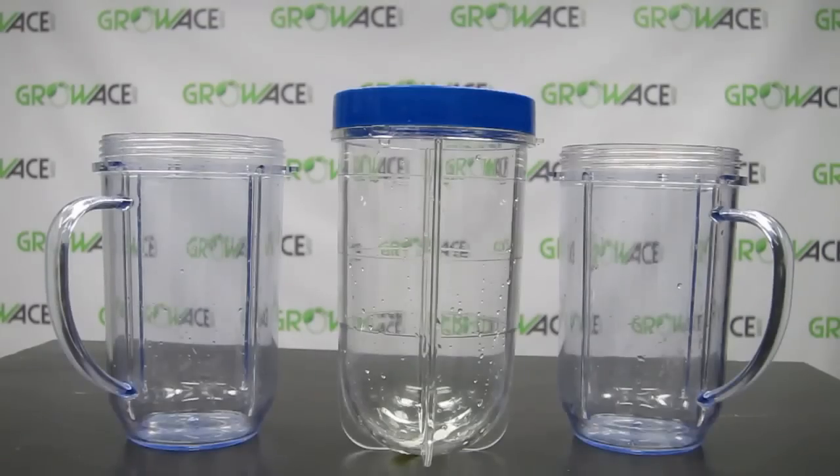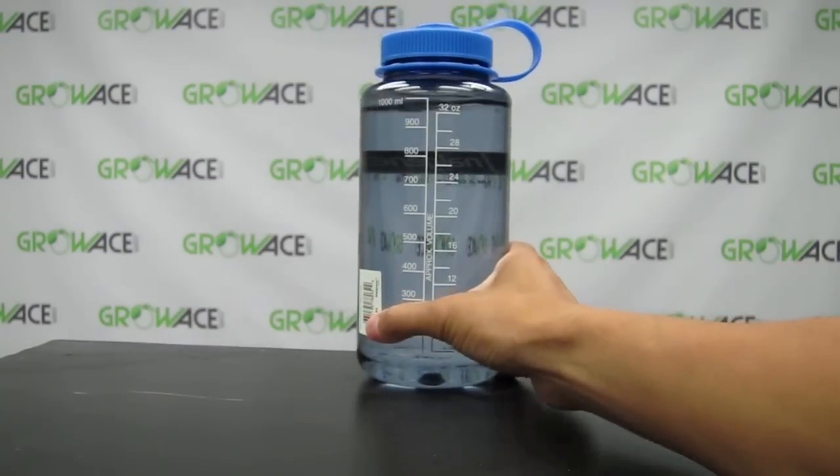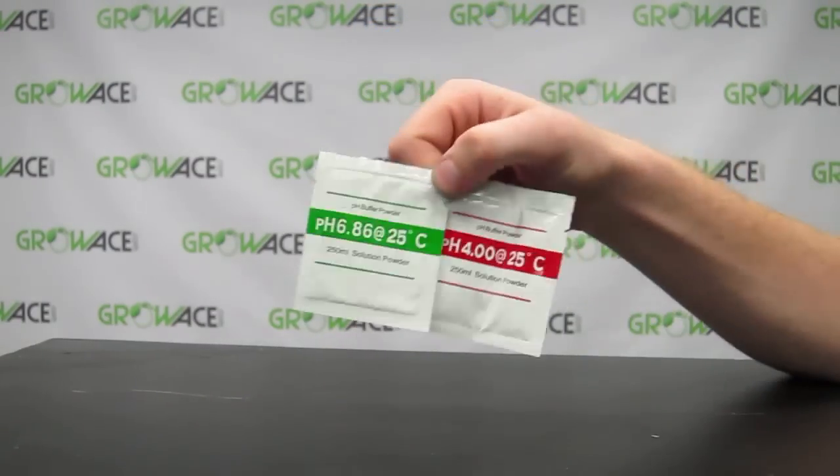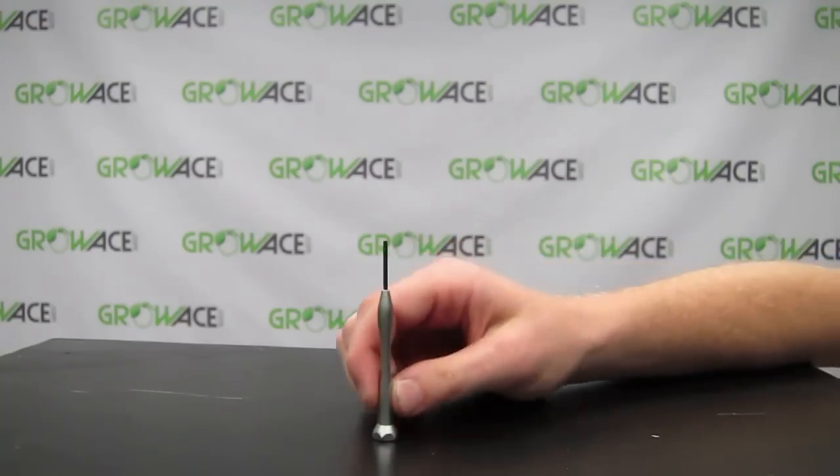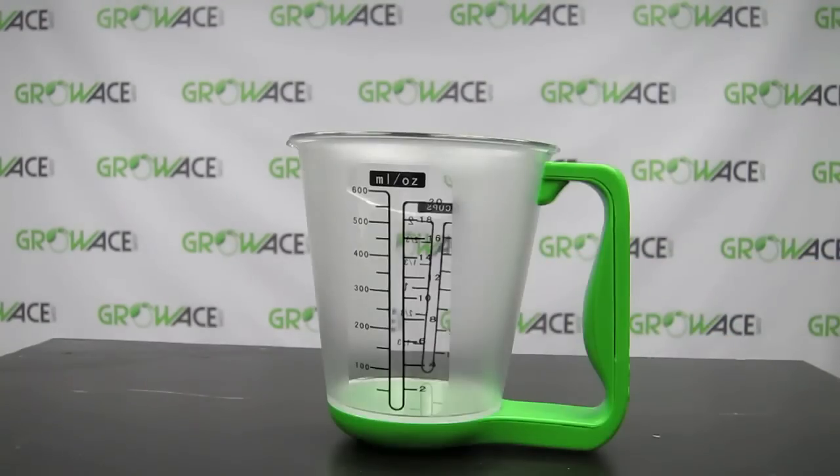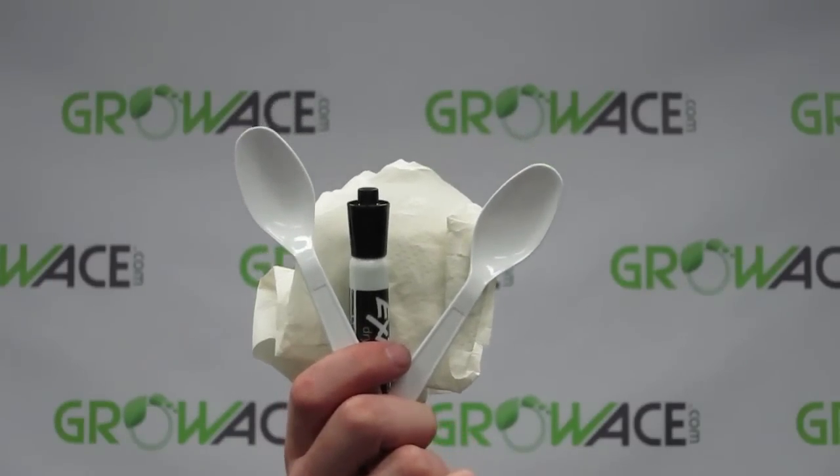The tools needed are three cups, 1000 milliliters of distilled water, the pH buffer packs that come with the meter, a small flathead screwdriver, a measuring cup, two spoons, a marker, and some napkins.